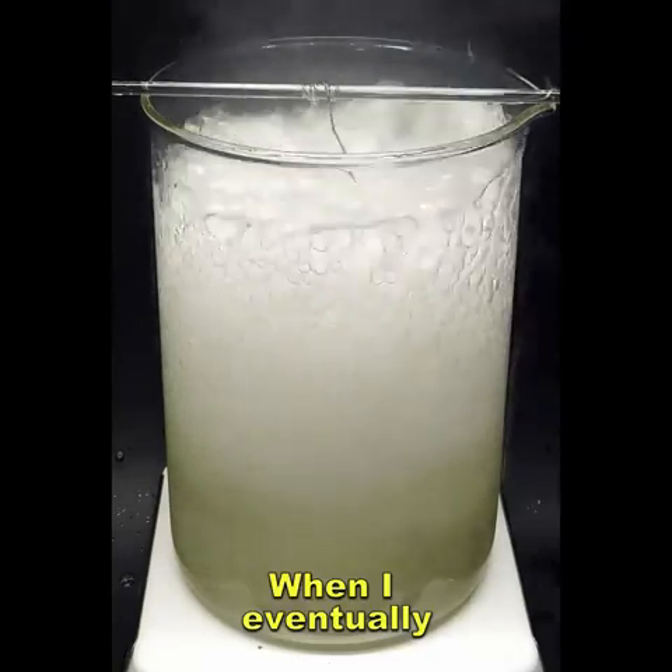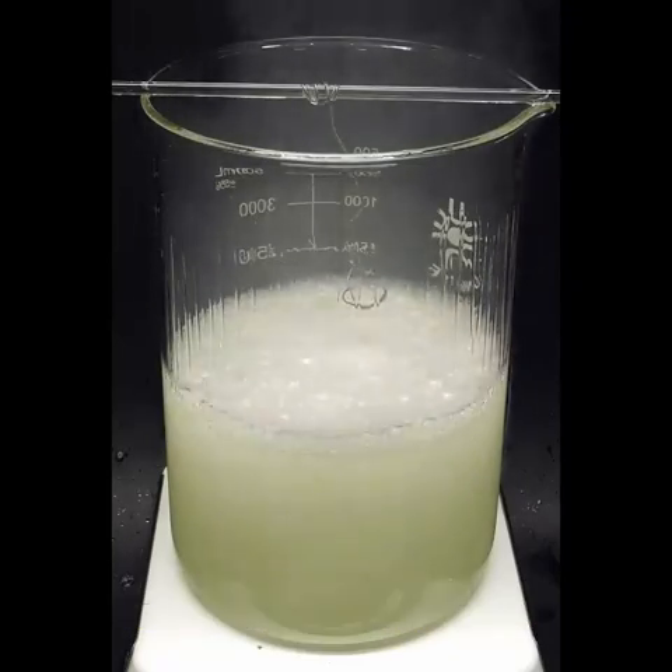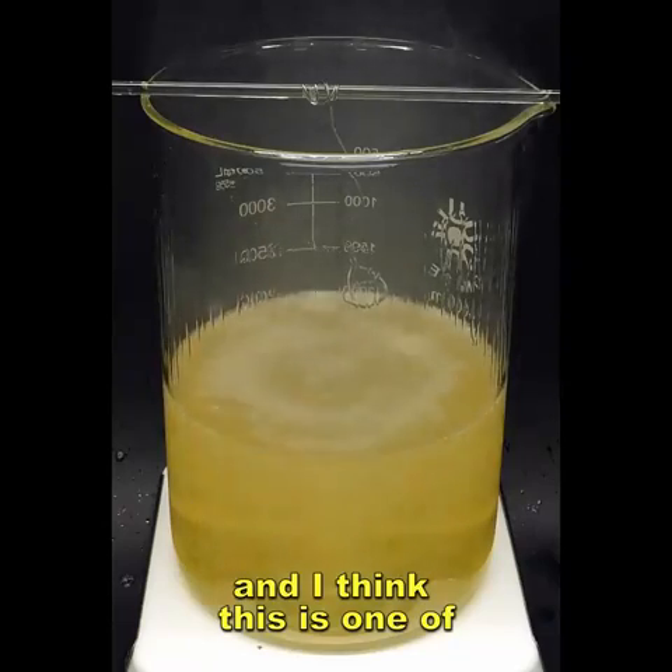When I eventually stopped adding the peroxide, I was actually shocked by what I saw. There was absolutely nothing left, and I think this is one of the most terrifying things I've ever done.